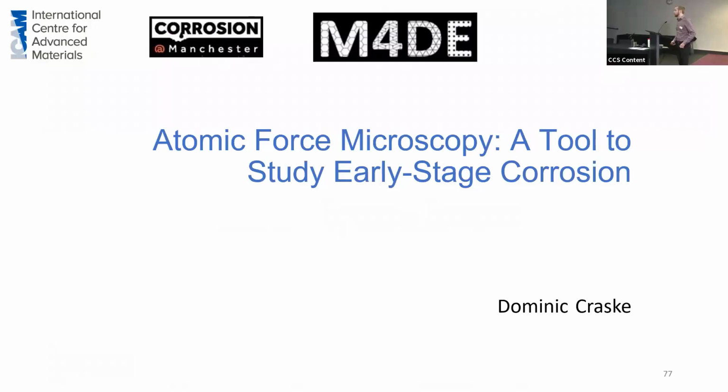Hello everyone, my name is Dominic Craske. I'm a final year PhD student here at the University of Manchester, and the title of my presentation today is Atomic Force Microscopy, a tool to study early stage corrosion.